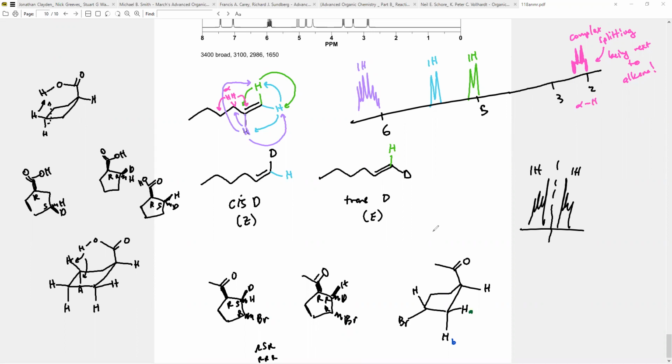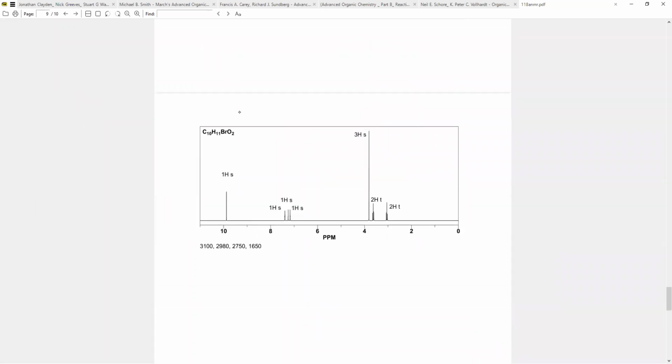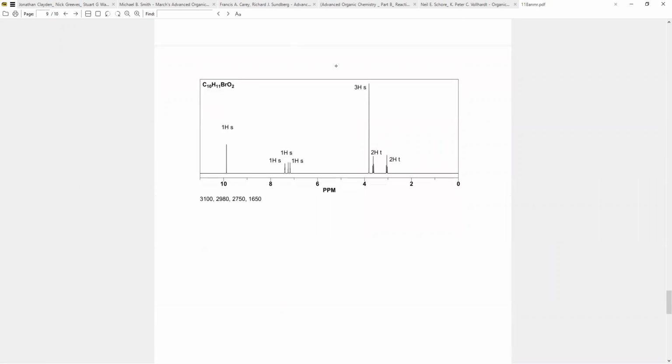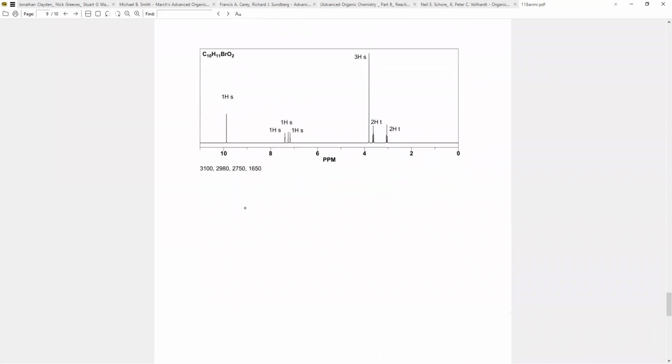Okay, cool. All right, so that's diastereotopism. We'll call it on that. If you guys have any more questions, obviously let me know. I'm more than happy to answer them. But let's get on with these NMRs, right? Let's kind of finish this out. So we'll do the first one. And actually, if you look, both of these NMRs have something special about them. That's what makes them hard. But we'll do this one first.